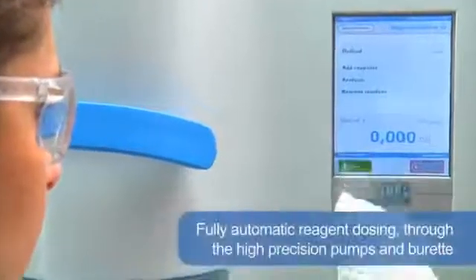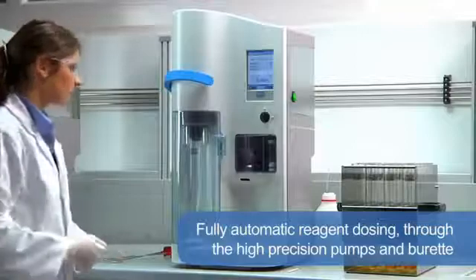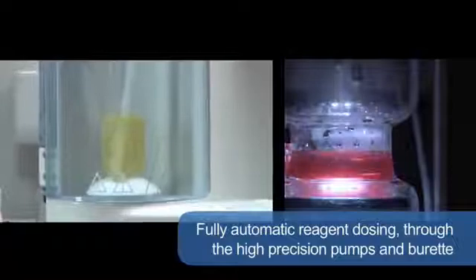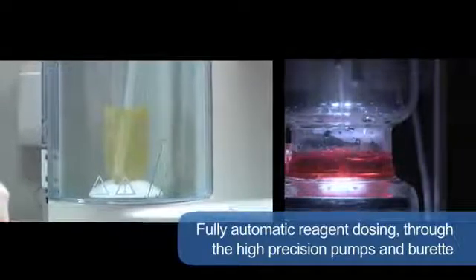Fully automatic reagent dosing such as alkali, dilution water, and receiver solution using the high precision pumps and burette guarantees simple and safe operation with reliable analytical results.